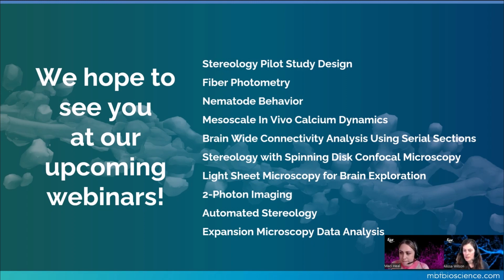To cover the resolution of your data, again, it's going to depend on what you're looking at. If you're looking at those large vessels, you don't need the resolution as someone trying to look at something tiny like spines or other small objects. So that will really depend on what you're looking at, but you definitely want the resolution so that as you're moving through your stack you can identify changes and be able to easily see those objects. Absolutely.